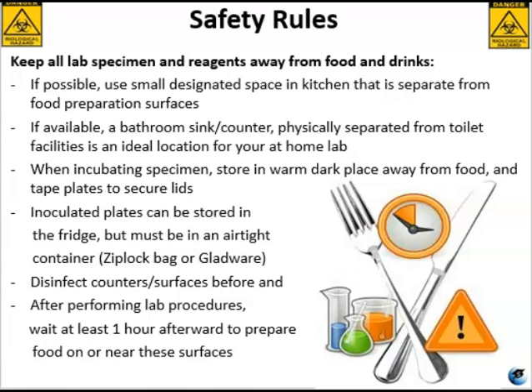coli and other microbes when they're flushed. And that's true even if you flush with the toilet lid closed, by the way. When you're incubating specimens, you want to store those plates in a warm, dark place, again, away from food. You want to tape the plates closed to secure the lids.